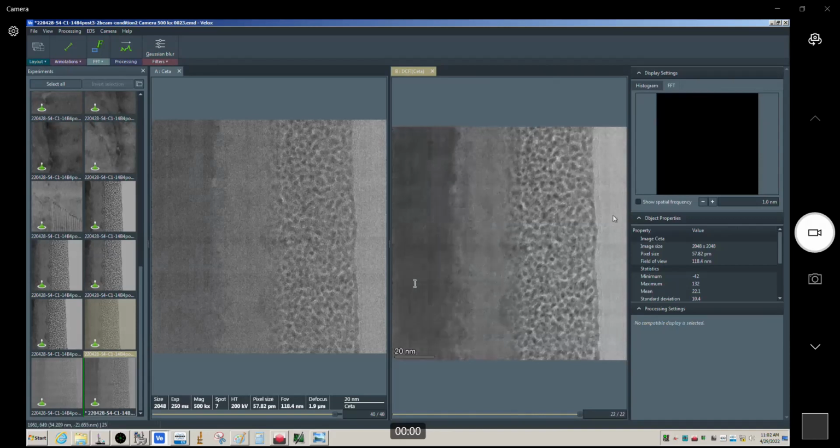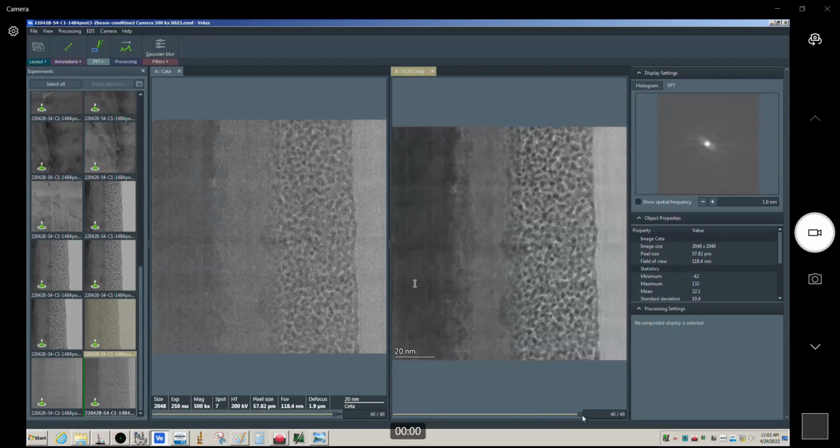Yeah, see, it's still smearing out. Interesting. So you're right, then you can take this and cycle it through and see the effect. It should, anyway. Why is it not doing it? Okay, yeah, you can see.